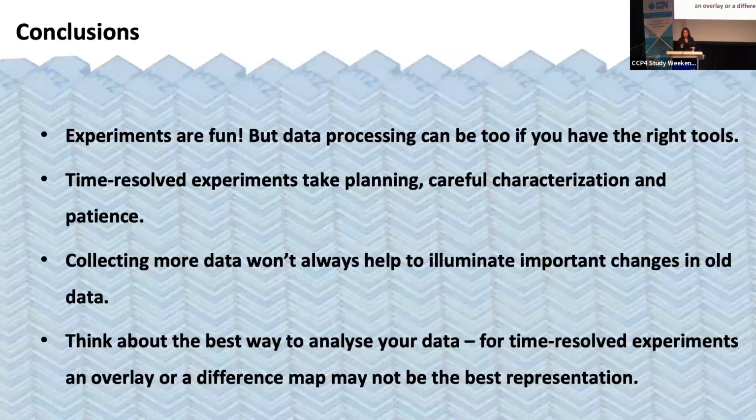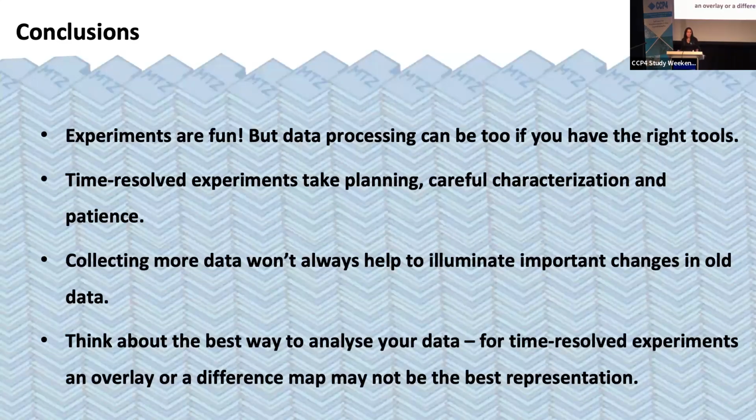So in conclusion, I'm an experimentalist. Experiments are really, really fun, but data processing can be fun too if you have the right tools to see what's happening in your structures. Time-resolved experiments really take careful planning, characterization, and a lot of patience. It's often a good idea to keep going, but sometimes it's worth sitting back and really interrogating your data and thinking about what it's showing you. And collecting more data won't always help to illuminate the problem.